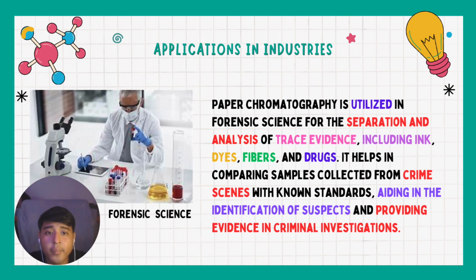It helps compare samples collected from crime scenes with known standards, aiding the identification of suspects and providing evidence in criminal investigation to find the thief.